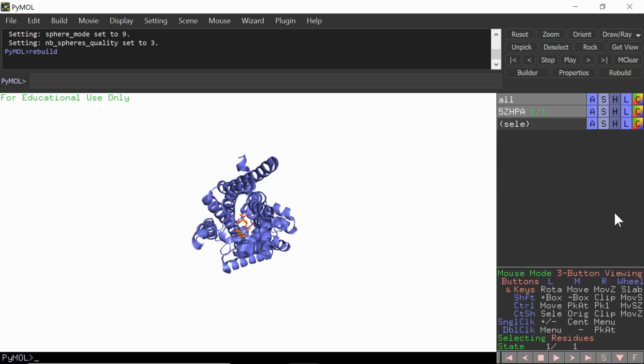Here is an example of a bad pose. Although the ligand is very easy to see, the receptor looks clumped due to bad positioning. In addition, directionality is not being used to show the intracellular from the extracellular portions.